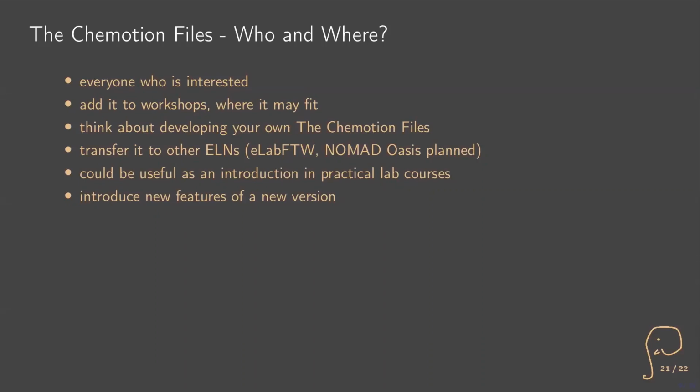We have enough data in the Chemotion repository, for example, with which you can work, right, and make something like a hackathon out of it, something of a competition, and then they get really familiar with working with data, and they will see by working with data what is maybe missing in the data set, and will learn for themselves what information should be published and what information should not be missing in my ELN or in my data publication, right?